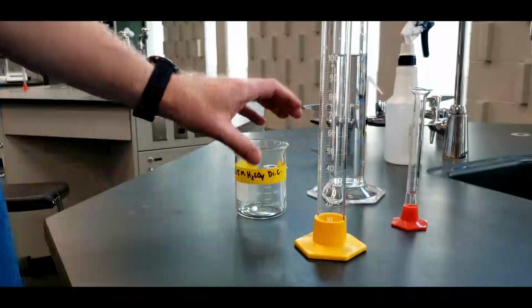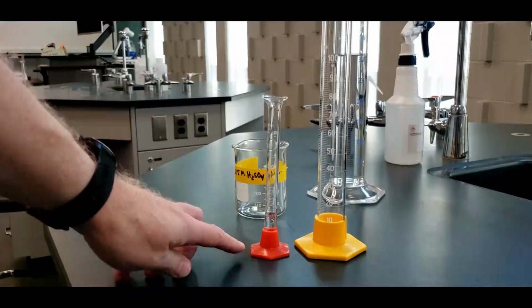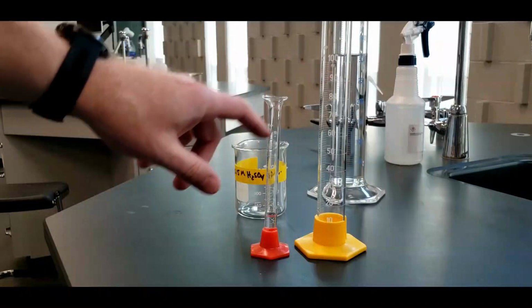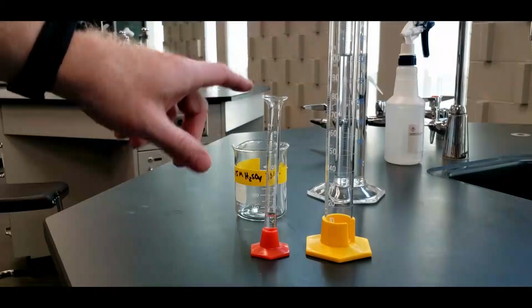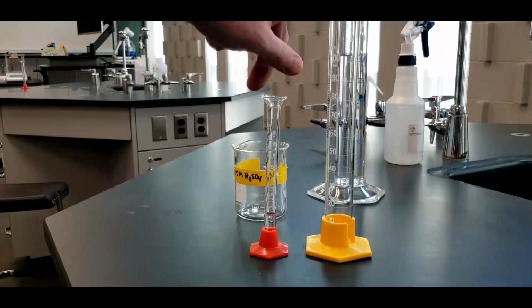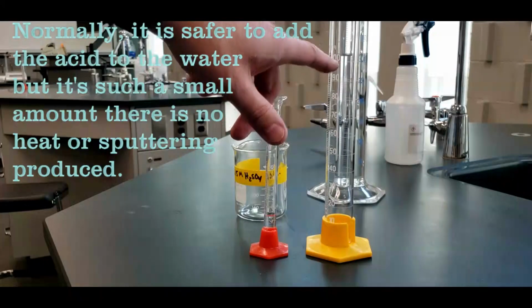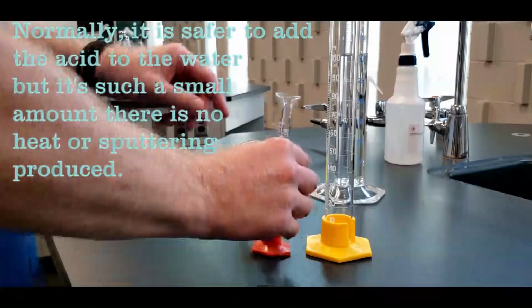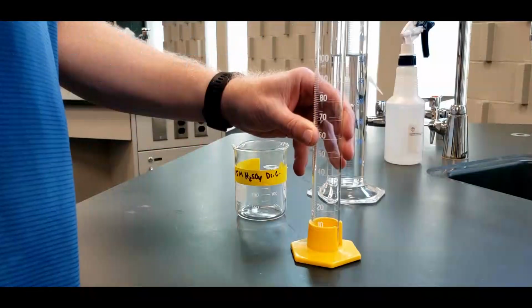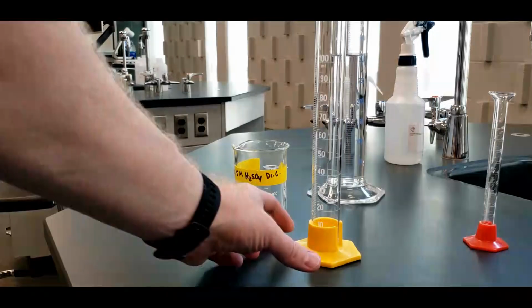All right, so we need to take this 2.5 mils of the sulfuric acid and dilute it to 100 mils. Now the book has one way of doing it. I'm going to do it this way, where I'm going to put in the 2.5 mils of the sulfuric acid in here, and then I'm going to fill it up to the 100 mil mark. That's a quicker way, and I think it's even more accurate than what the book suggests. So we're going to do this. That's the 2.5 mils of the sulfuric acid.